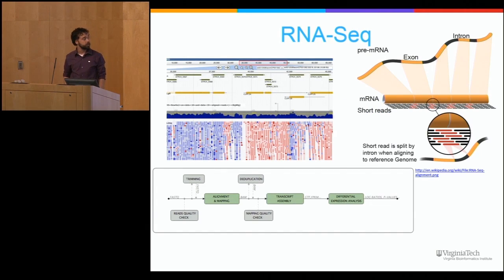First, I want to talk to you a little bit about the problems we've seen with RNA-Seq analysis. We have a website that we put up. It's called RNA-Rocket, and we have more than 1,000 users there. What we've found is that the promise of RNA-Seq is that you can just sequence what's floating around in the cell and see what's going on, as a snapshot, which is a lot more powerful, in theory, than microarrays where you have to design what you're looking for.